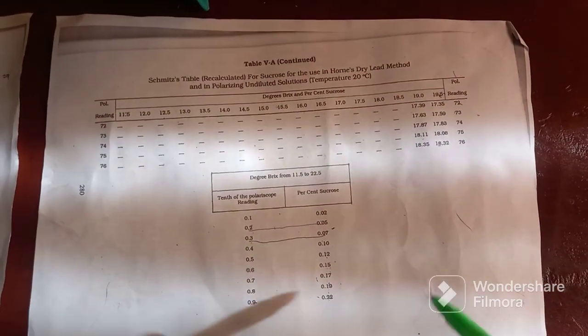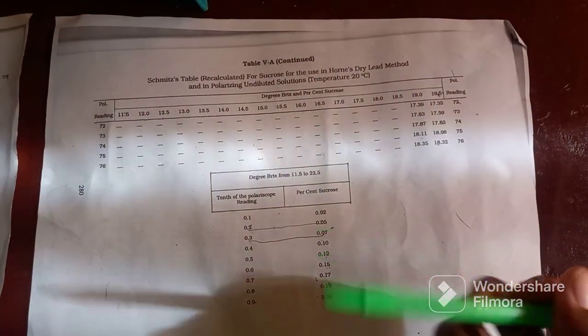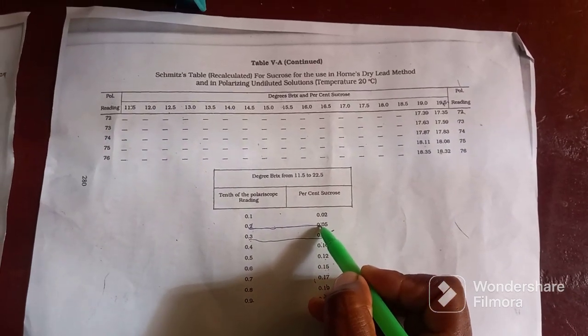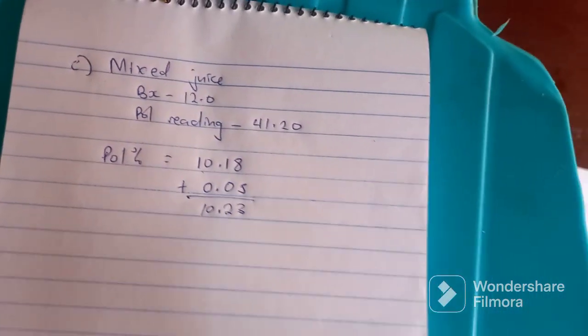So let's get the pol percent of 0.2. We use this table. So for 0.2, it's 0.05. So we'll take 10.18 plus 0.05. The total will be 10.23. So pol percent of mixed juice will be 10.23. Our fourth sample was clear juice.